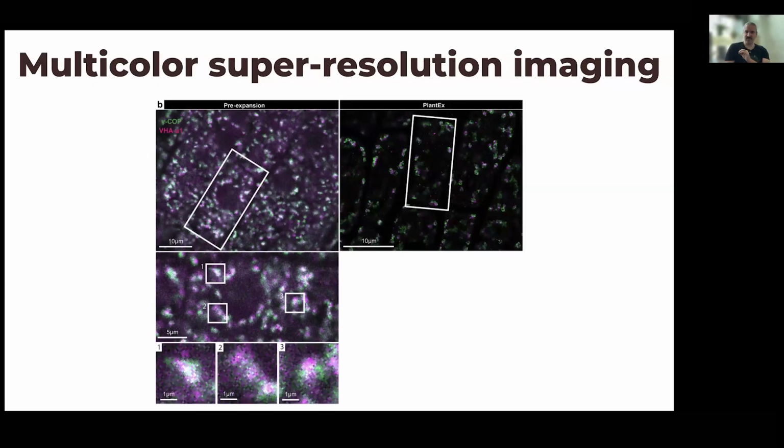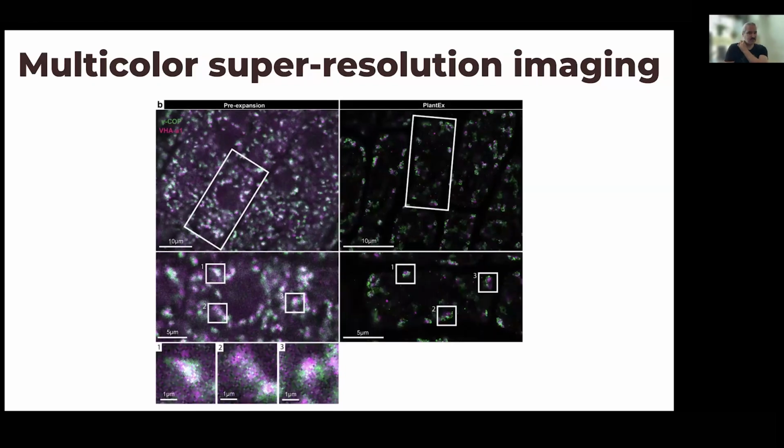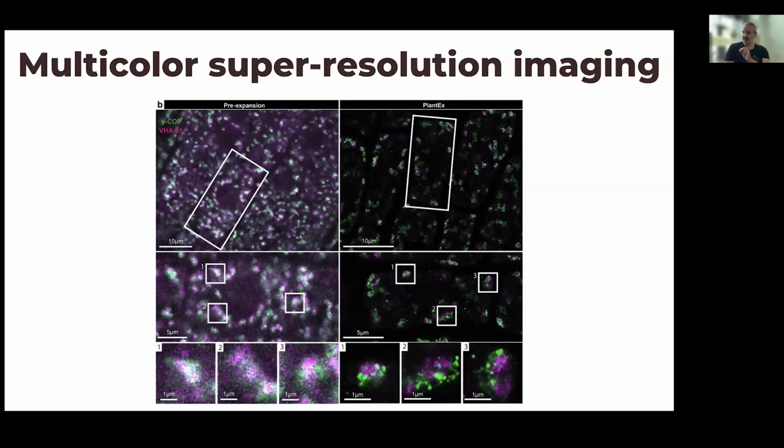So now let's look at them with expansion microscopy. Again, already from a distance, everything looks much crisper. And now let's zoom in. You can now see the individual Golgi stacks here. And then you can really see the individual vesicles, which are forming these clouds around the Golgi stacks. So now we get to a real multicolor representation at high structural accuracy of these transport pathways.